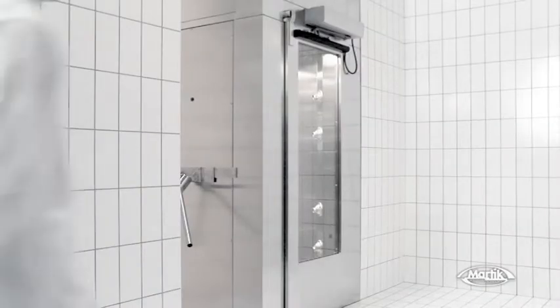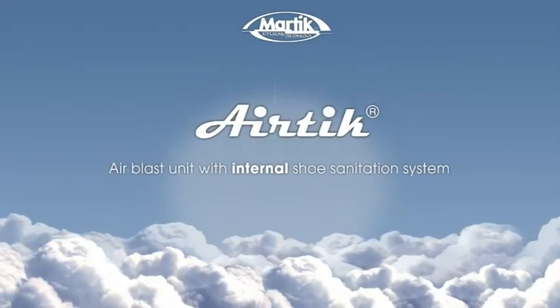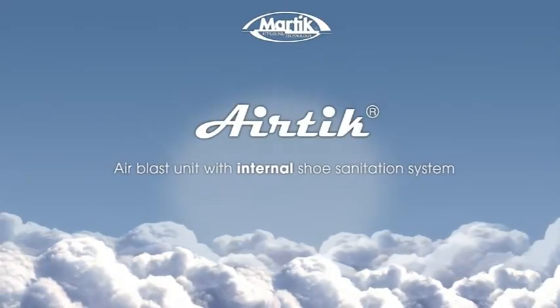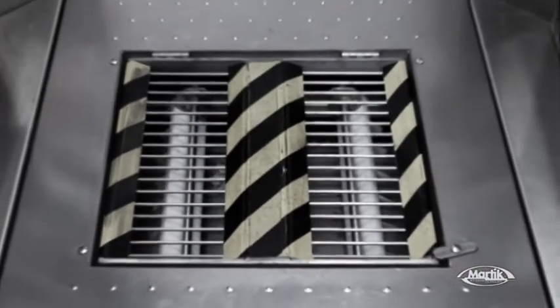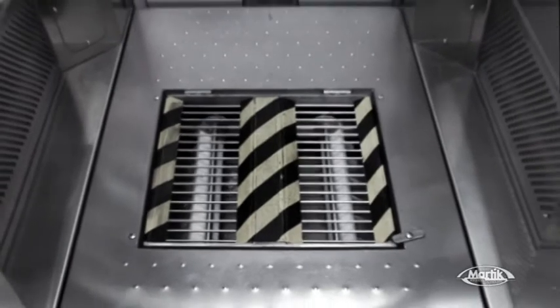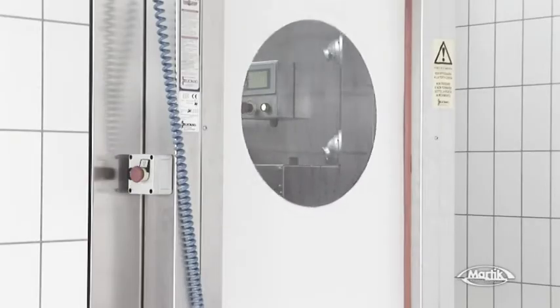To leave the clean room, you have to pass through a turnstile that ensures one-way exit. Unlike the previous model, the salt sanitizer is fitted inside the equipment and, to save space, it has a quick self-roll-up door.